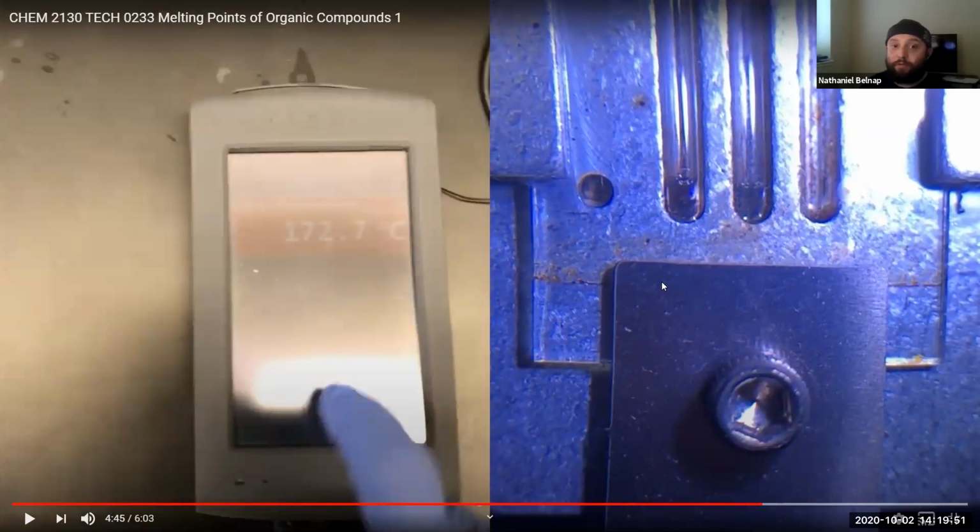So these are some huge ranges for supposedly pure compounds. But then again, we still have to look at what the actual melting ranges are for these. I don't think they're this big though.